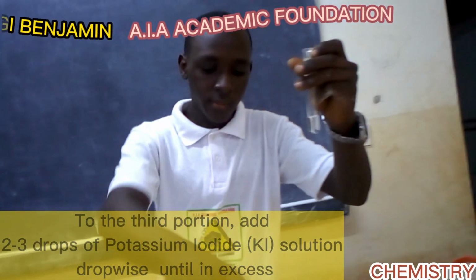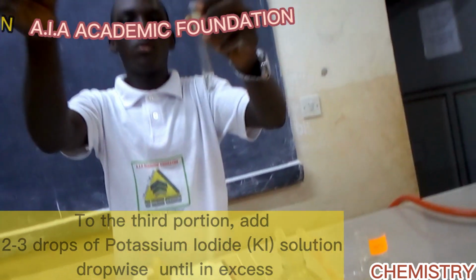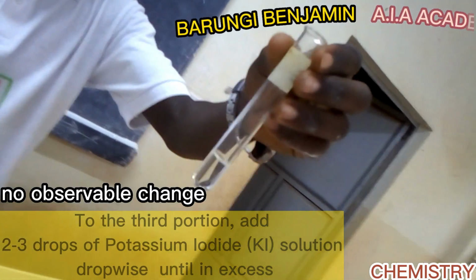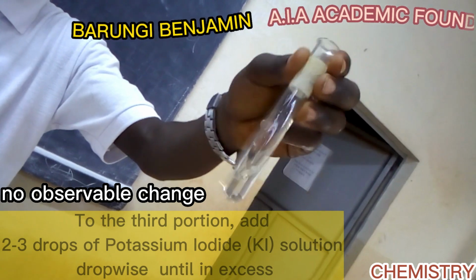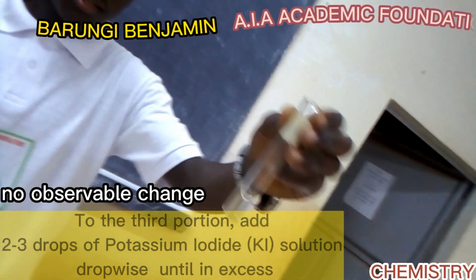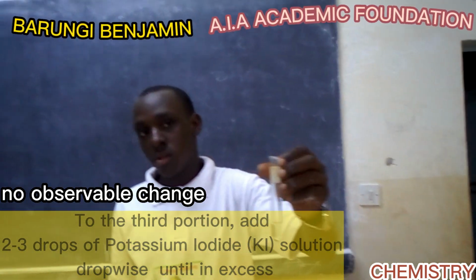So let us see. This is our potassium iodide. Say 2 to 3 drops, 1, 2, added, but the solution is still colorless, which means there is no observable change. So this is the confirmatory test for aluminium ions.